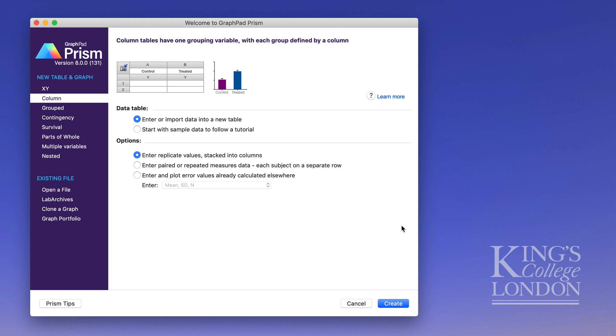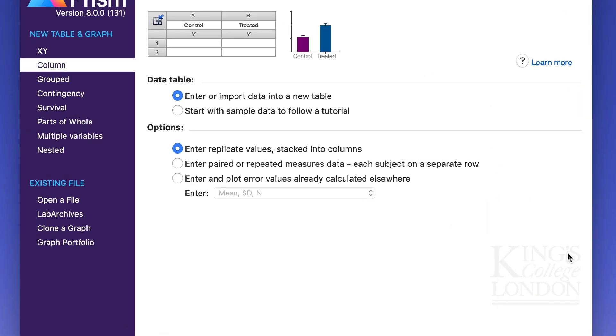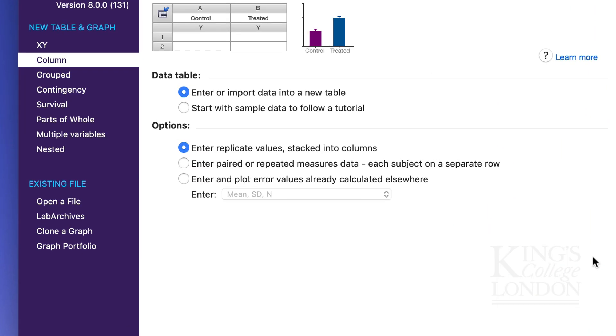When you open Prism it brings up this Welcome to GraphPad Prism intro screen and in order to undertake a t-test you need to select from the left option column and from the data table option enter or import data into a new table.